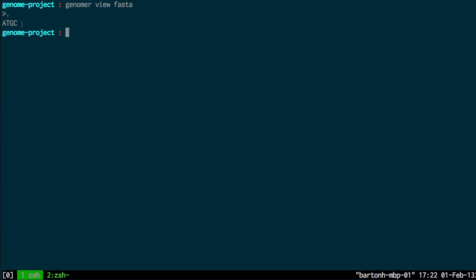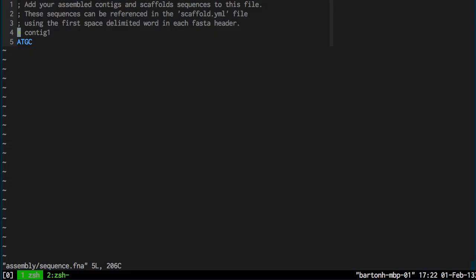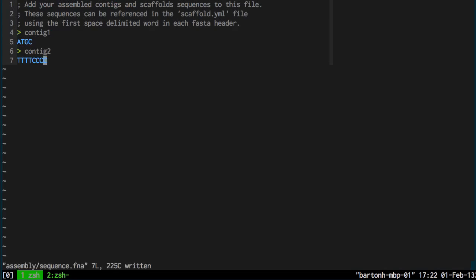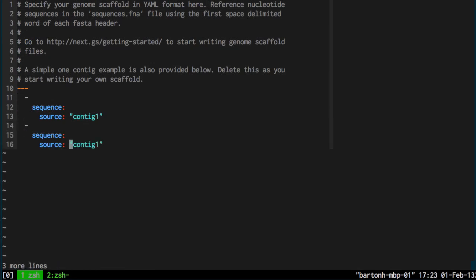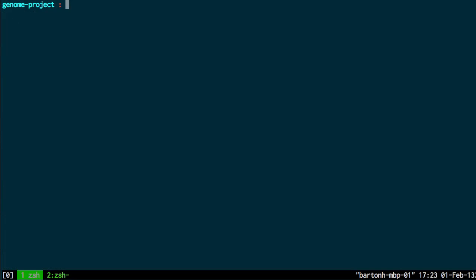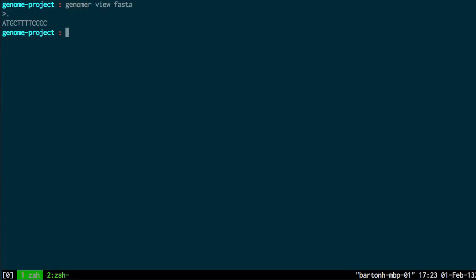But say for example I wanted to add more contigs to my scaffold. So let me just copy this. And I'll just copy this and put that in there. Contig2. So here I've just copied and added an extra contig in there. Contig2. And if I run that command again, Genoma view FASTA. Again it just generates the FASTA format of the scaffold of combining those two contigs.